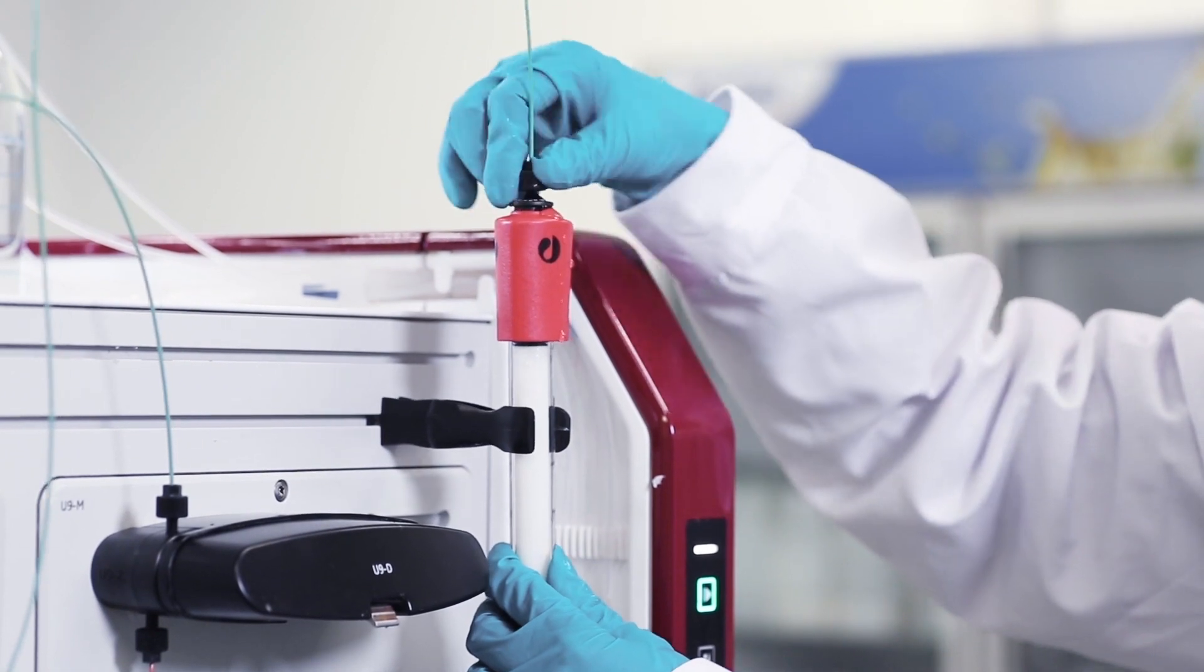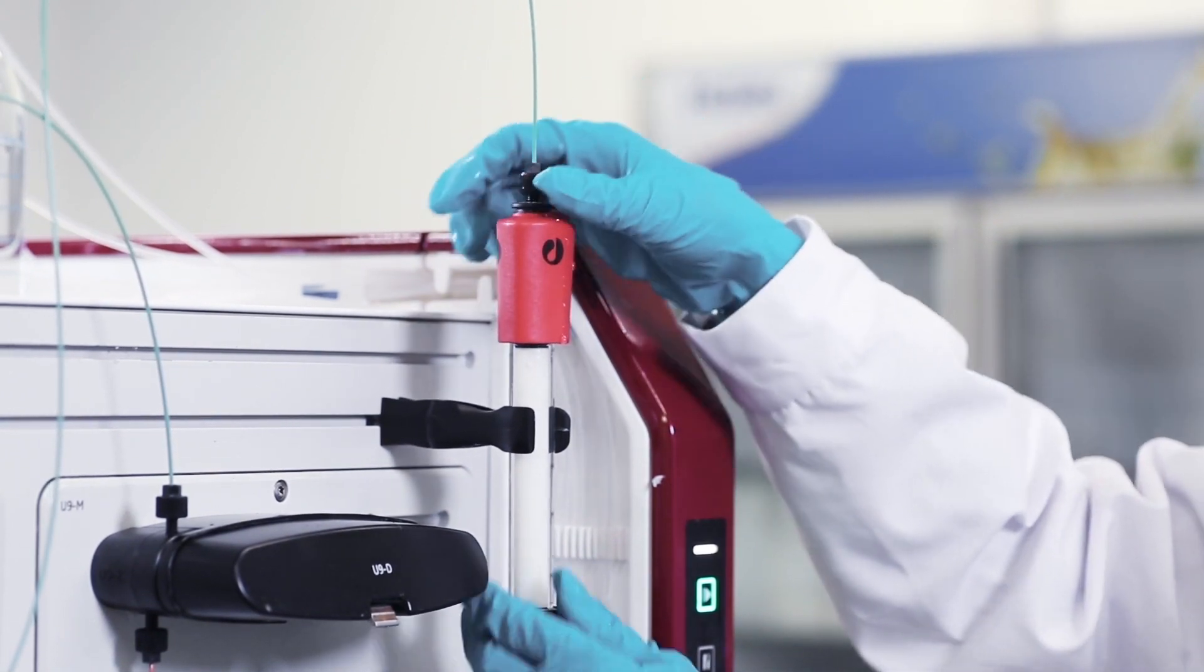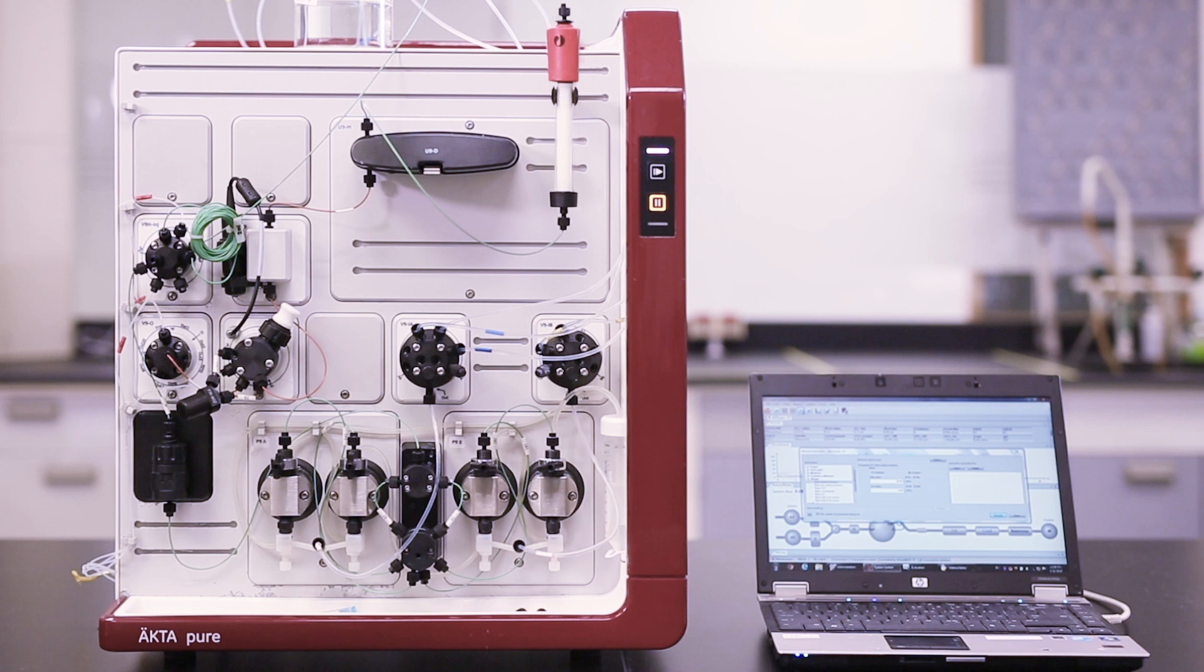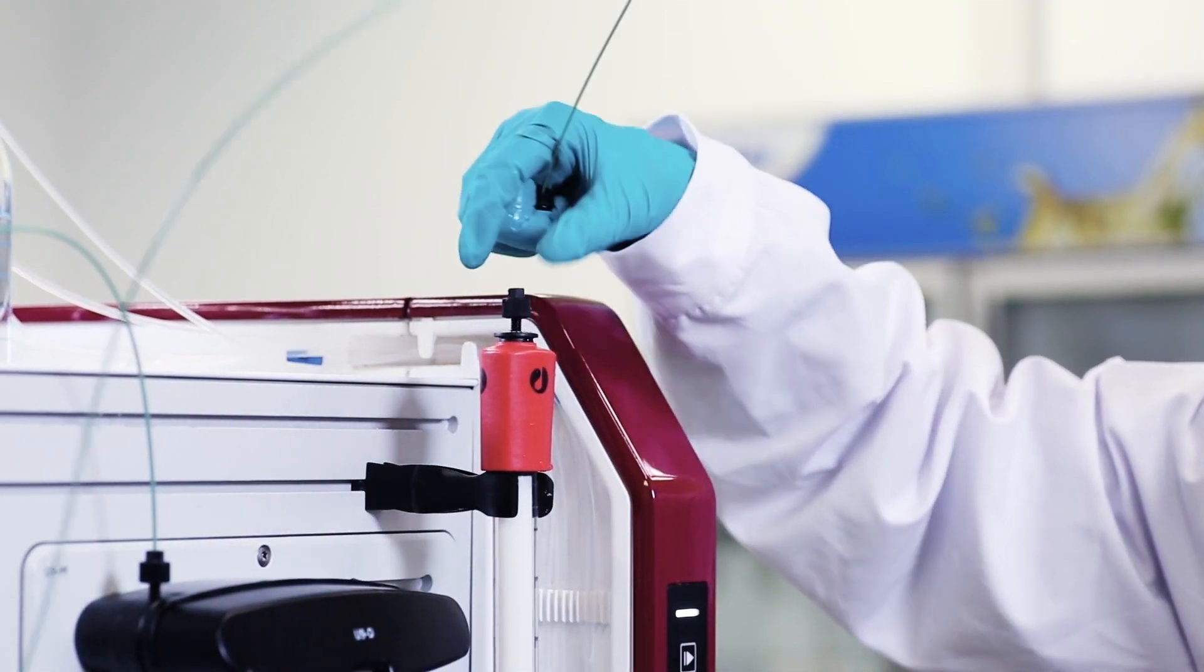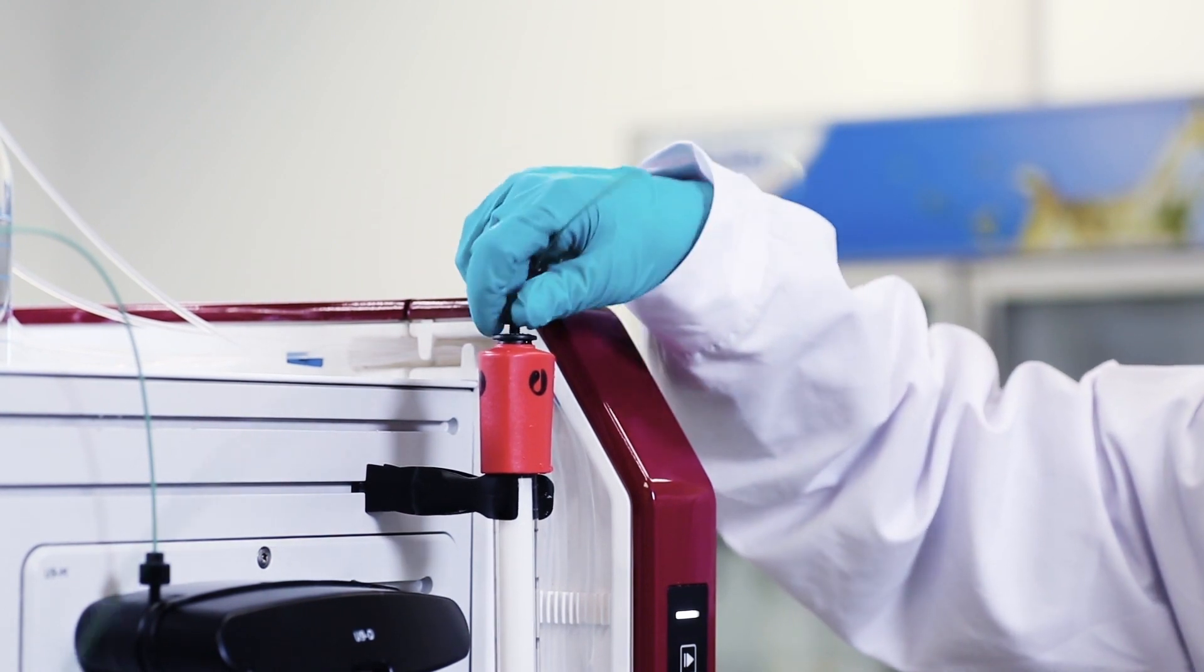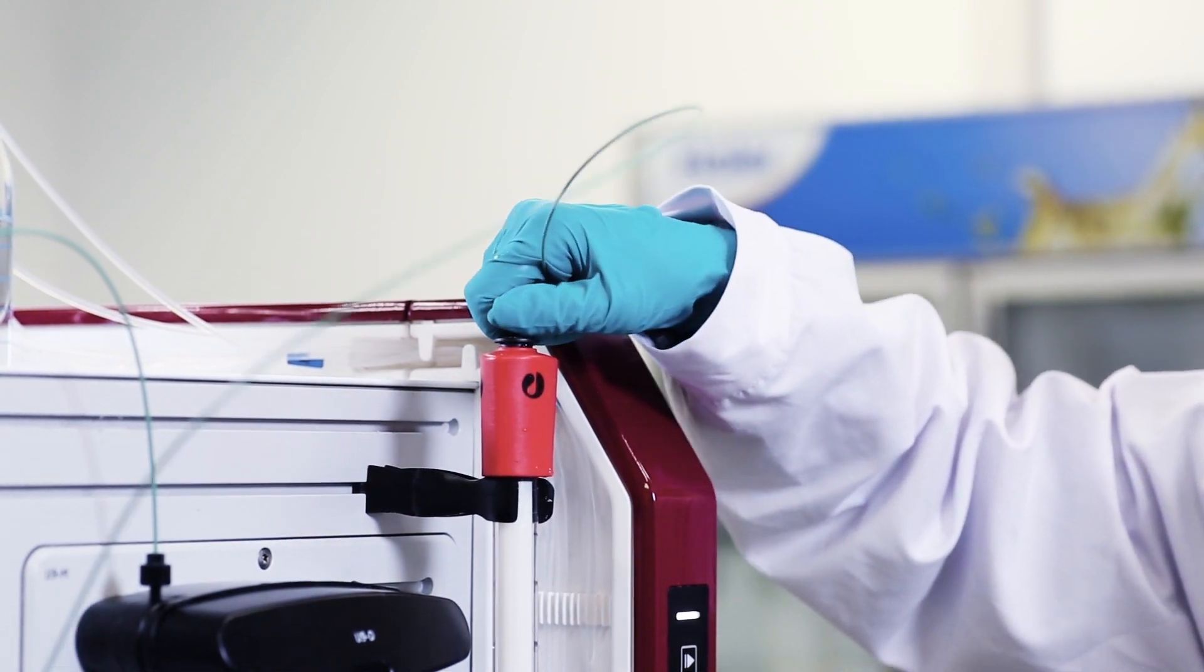Your column is now packed. If you are not using the column right away, remove the connection to the pump. Screw stop plugs into both the top and bottom end of the column. Inspect for any channel or gap and your packed column is ready to use.